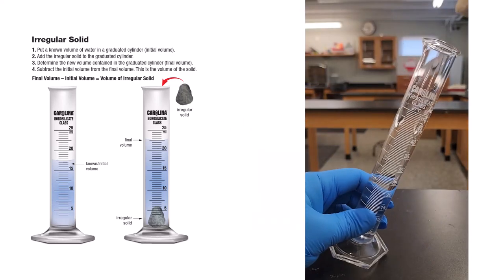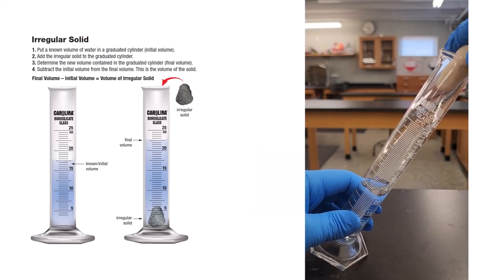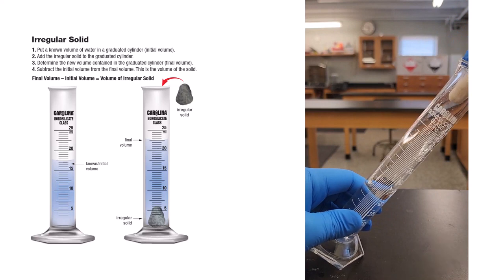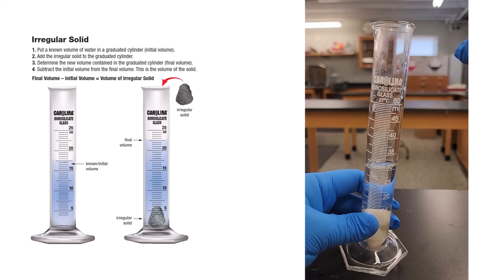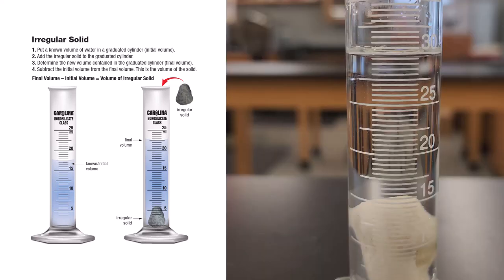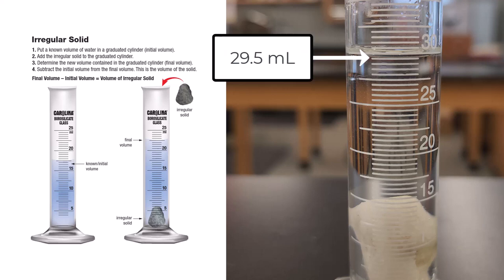Add your irregularly shaped solid to the graduated cylinder. In this example, it is a rock. Examine the water again at eye level. Read the numbered mark at the lowest point of the meniscus. In this example, the lowest point of the meniscus is at 29.5 mL. This is the final volume.